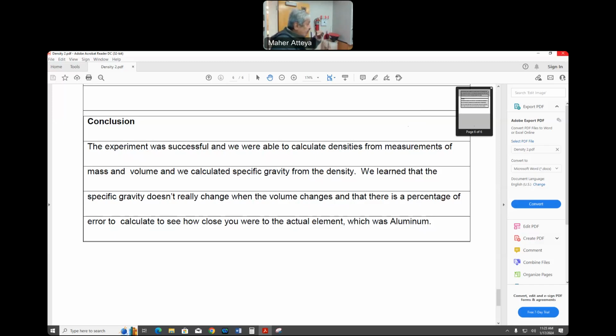Is everyone following? I took more than half an hour to show you how we will follow in the future. So what you have to do: read those two, blue and green, measure the dimensions of this, and go inside with the top load and the analytical balance. That's all. In 30 minutes, I'm expecting everybody will be done and everybody will hit the highway. Literally, not hitting the highway. In 30 minutes, you should be done. But I spent a lot of time going through this because it has to be clear for the next labs, how to write a technical lab report.